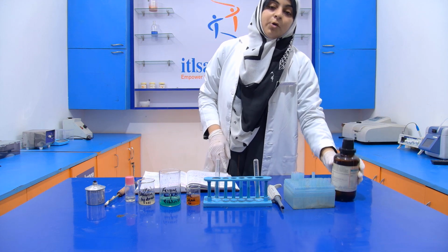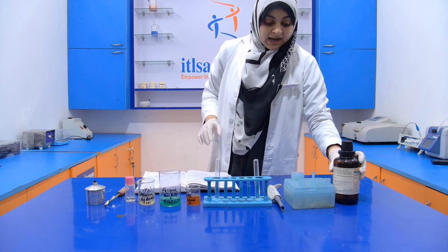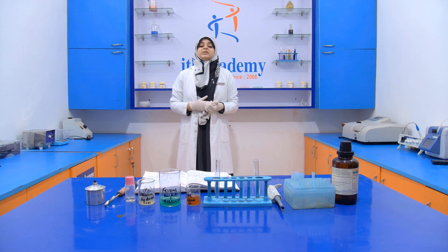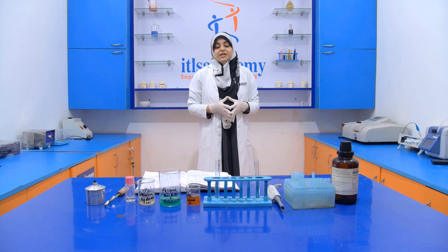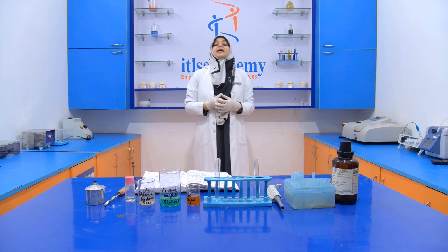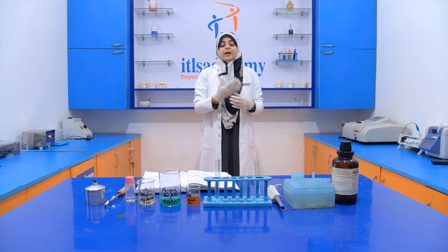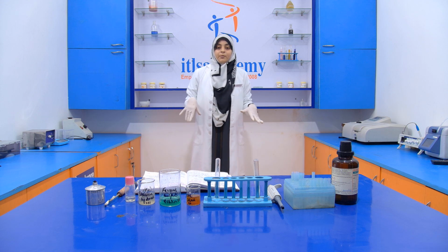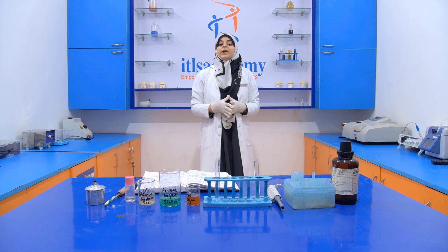One more chemical that we require is concentrated HCl. When we are handling concentrated HCl, we have to take extra precaution, because this concentrated solution is corrosive in nature. So we have to avoid contact with concentrated acids. When handling this, we have to wear proper gloves, a proper mask and a proper lab coat, and avoid contact with our skin and eyes.